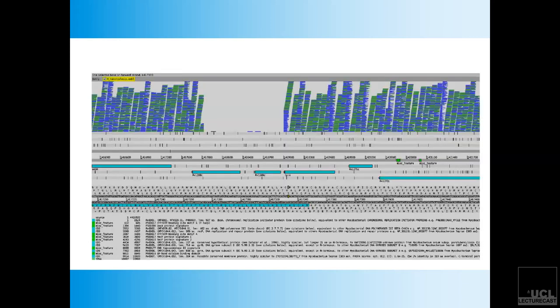Yes, please. So this is just an example of how, for simplicity, these green and blue lines are the fragments which you have sequenced, and then you have aligned them to your reference. The reference is properly annotated, so you know what each gene is, and then you know what each base is at any particular position along that 4 million base genome length of the reference. Questions?